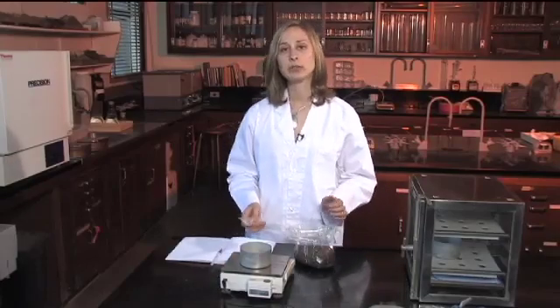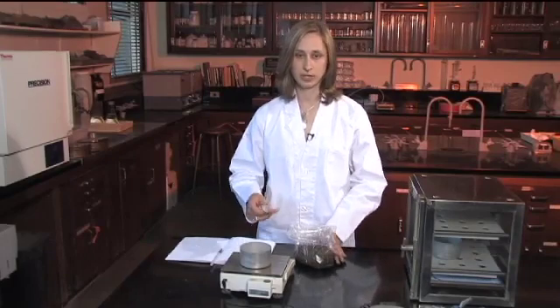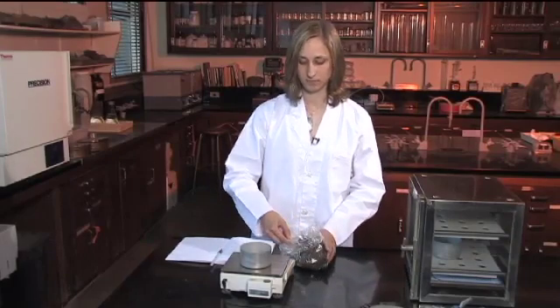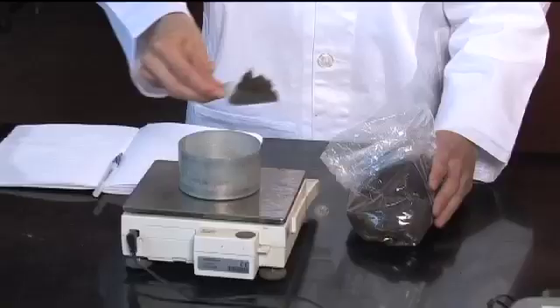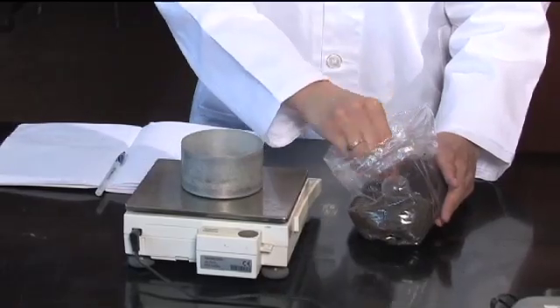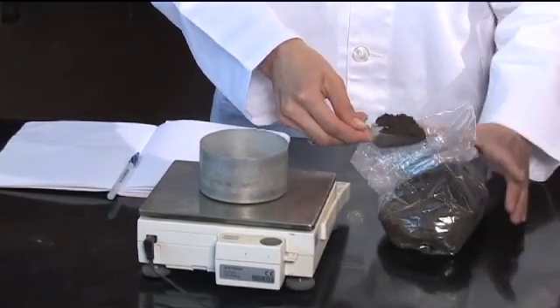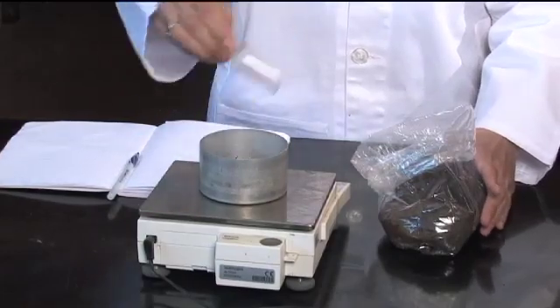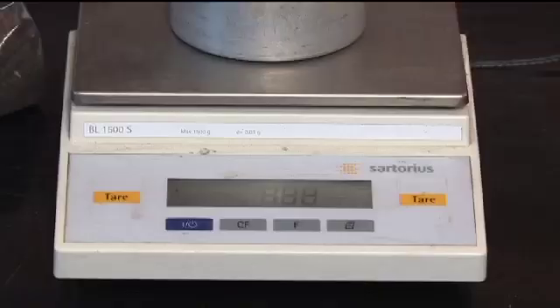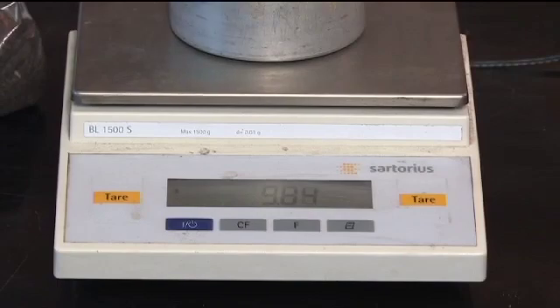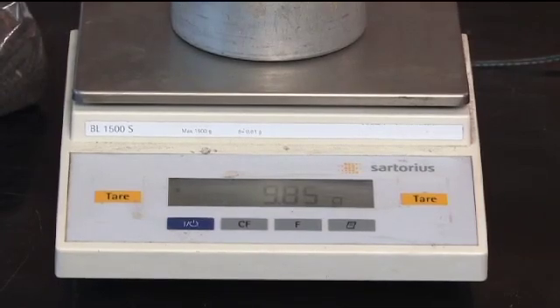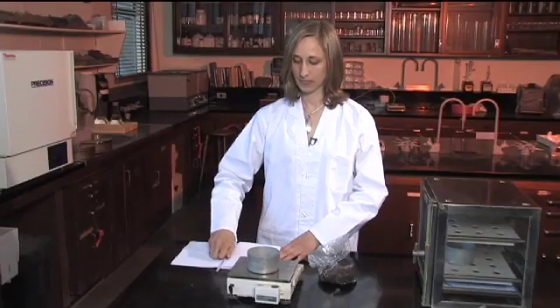Then weigh out about 2 to 10 grams of your moist sample and record the weight of the tin plus your sample. Then the samples go in the oven at 105 degrees Celsius.